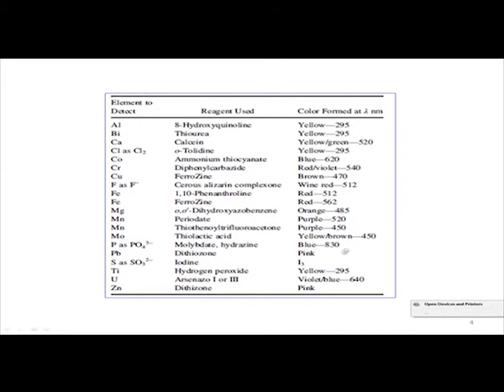In the NIR region the wavelength for this one is 830. The spectrophotometer can nicely detect that absorption, where an amount of light is absorbed by the medium, and the amount of light reaching the detector is measured.